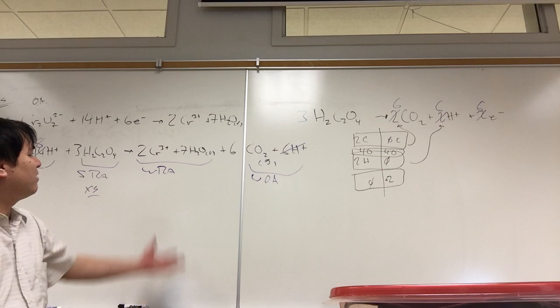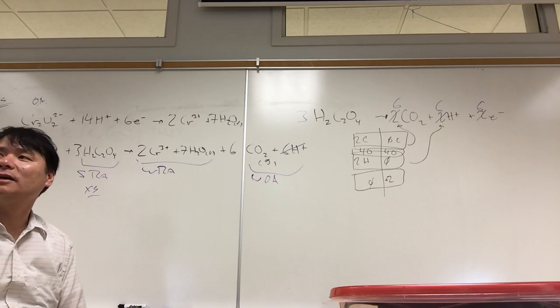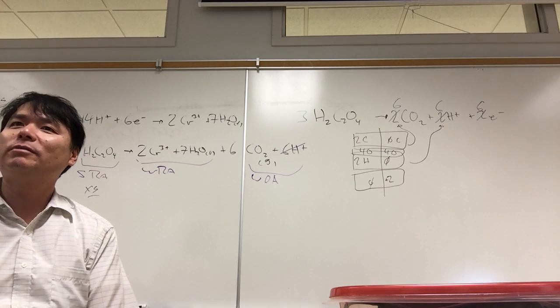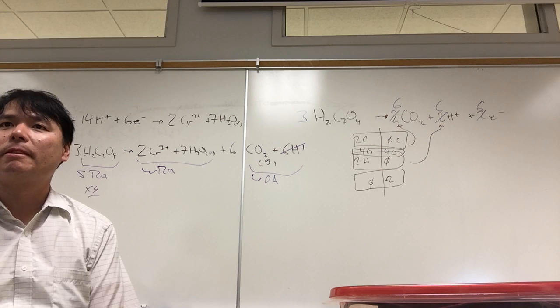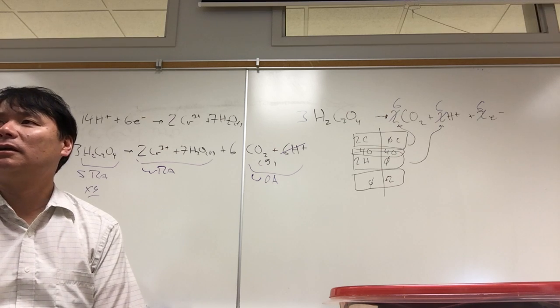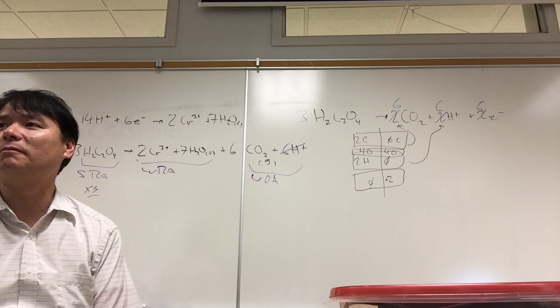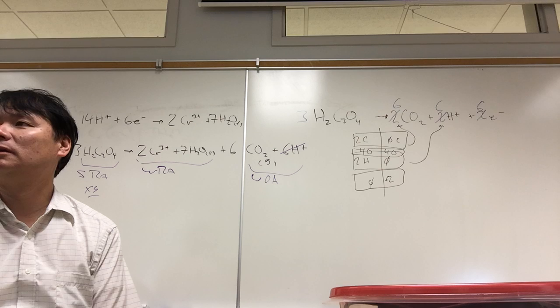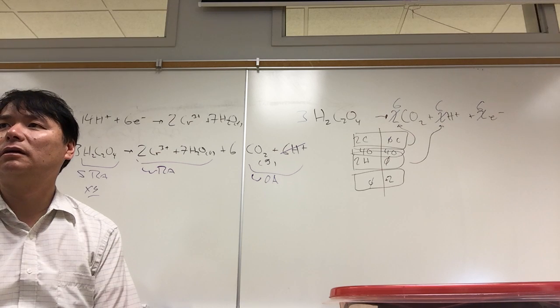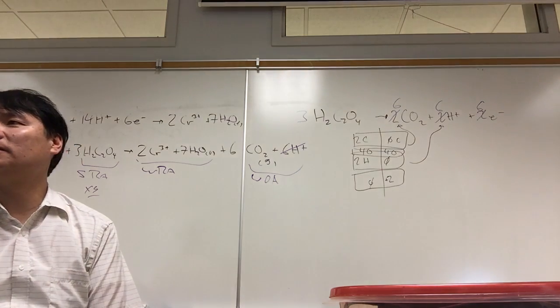So in this case, do we have any crystals we can rinse off? What are we going to do with this excess oxalic? How are we going to get rid of it? Do we have to get rid of it? Should we get rid of the excess oxalic acid? No, we're not going to get rid of the excess oxalic acid because we might be able to use it in the next step. What is the next step? We're going to add potassium oxalate.